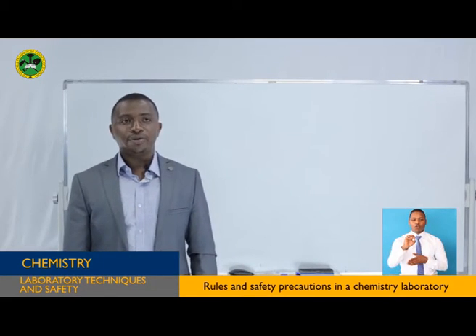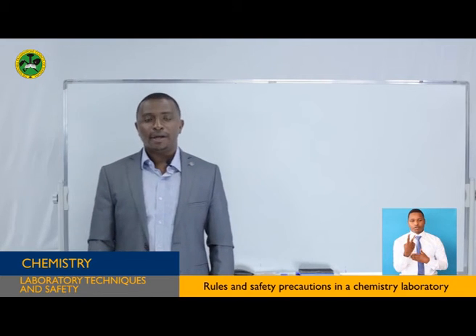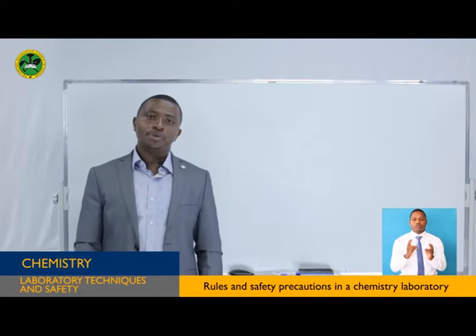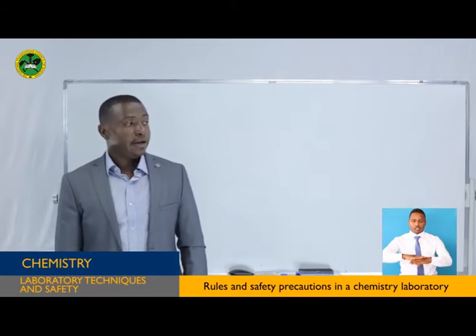Novatus Gabriel Moyo. I'll be presenting chemistry, and I'll be making a revision in Form 2, specifically a topic of Form 1, and that topic is called Laboratory Techniques and Safety. I'll be basing specifically on laboratory rules and safety precautions in the laboratory. So, dear students, be with me, enjoy the lesson.